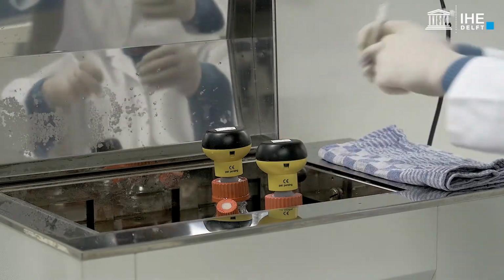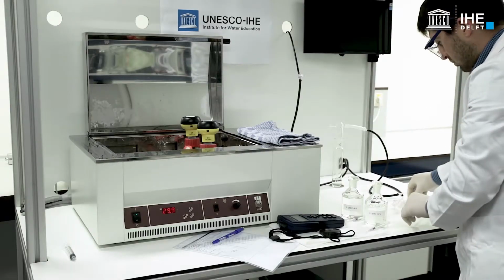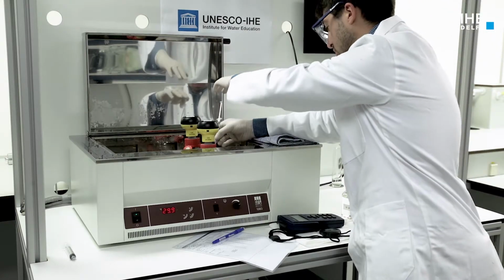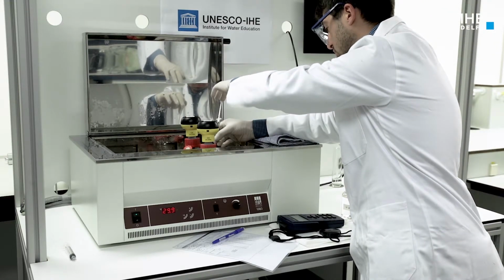The addition of the substrate solutions will decrease the headspace volume, resulting in a sudden pressure leap. This should be considered as an interference and disregarded during the data processing phase.